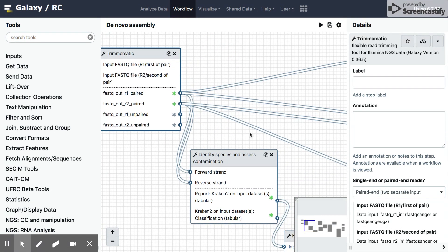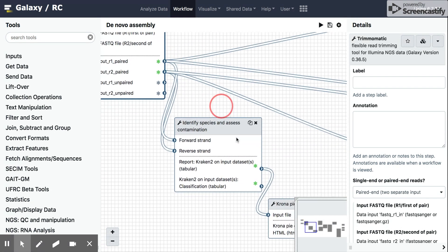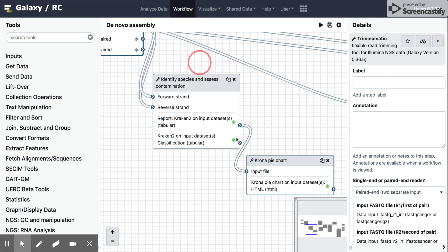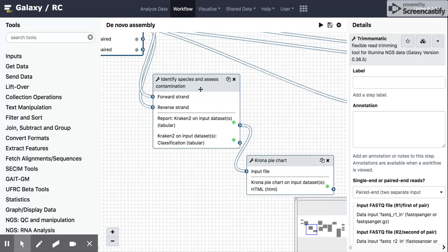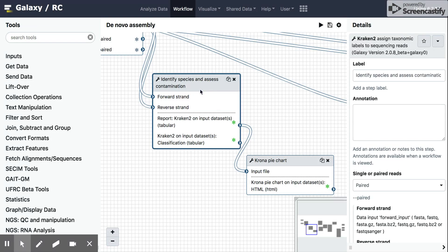And then here we see the new step that I added. This is tagged identify species and assess contamination, and it uses a tool known as Kraken 2. Now Kraken 2 is a species or taxonomic classifier that is usually run in a lot of metagenomic analysis on raw sequencing data, or you can use it on assemblies. But basically, what it does is it goes read by read and tries to match that read to some kind of taxonomic level.